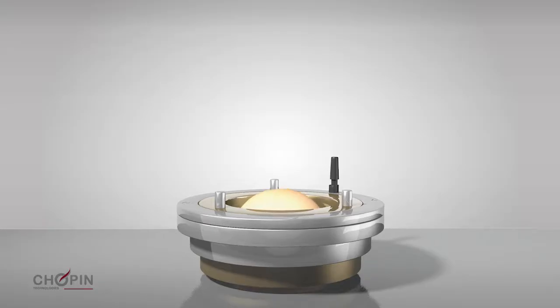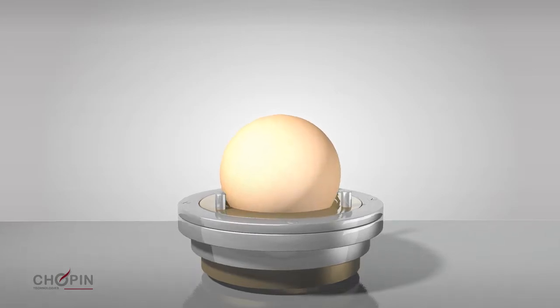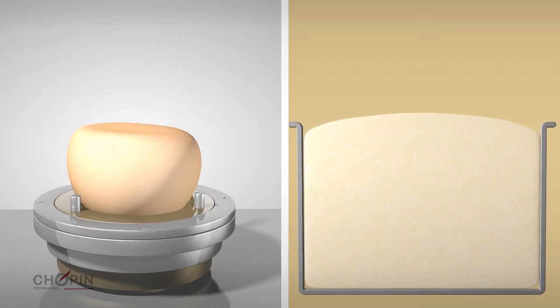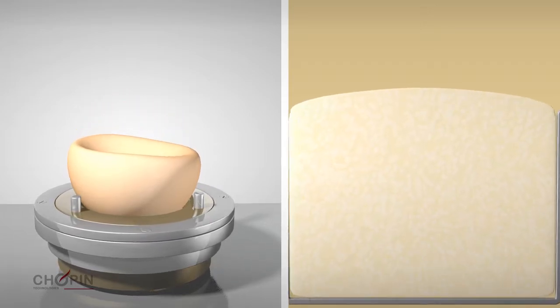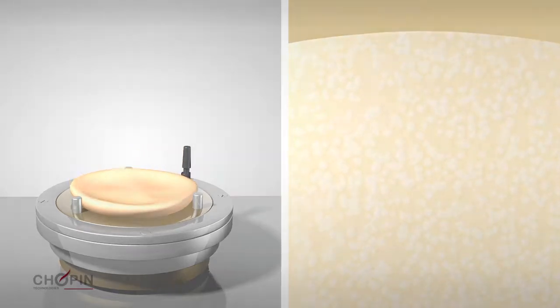An AlveoLAB test involves measuring the deformation of a dough bubble caused by a specific pressure generated using air. This dough extension method simulates the deformation the dough undergoes during fermentation due to the pressure generated by carbon dioxide. The AlveoLAB can be used to analyze all types of wheat, soft, hard, and durum.